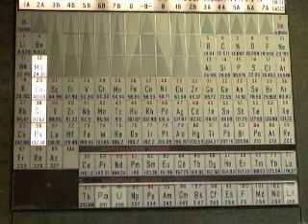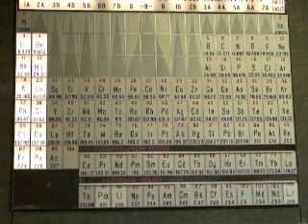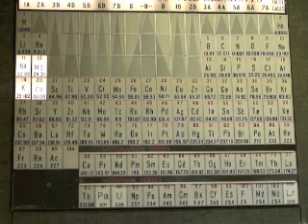Is the pattern observed for the alkaline earth metals similar to that observed for the alkali metals? Comparing sodium and magnesium, which was more reactive with water? Comparing potassium and calcium, which of these was more reactive with water?